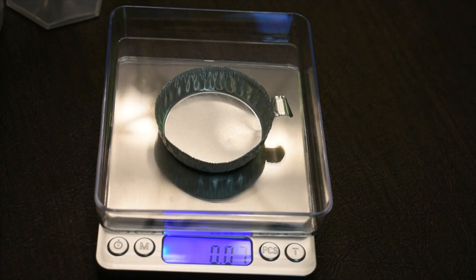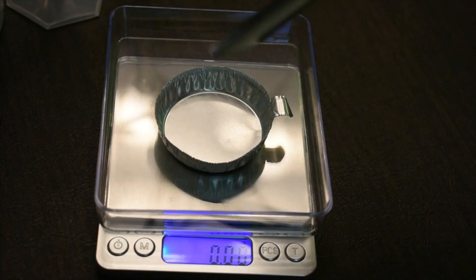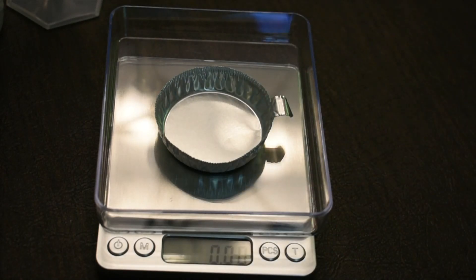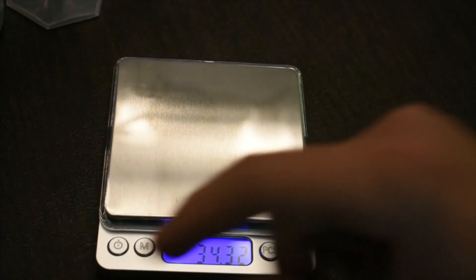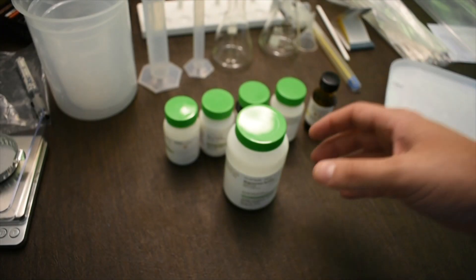You may need to hit tare once or twice to fully zero the balance. Once it reads 0.000, anything you add — like sodium carbonate — will be read directly as its mass. When you remove everything and see a negative value, just hit tare again to bring it back to zero. That's how you use the balance.